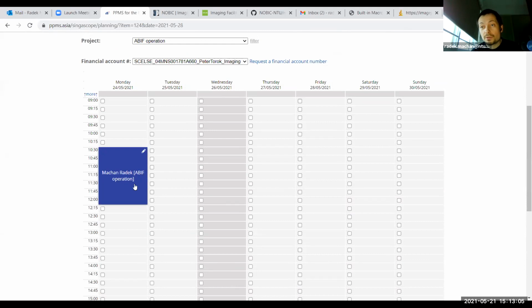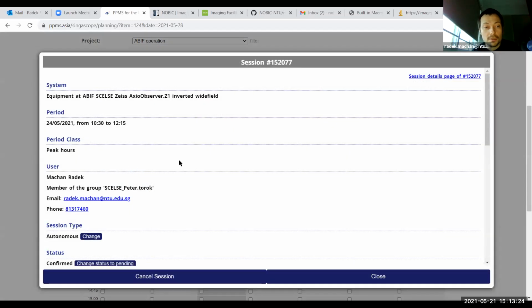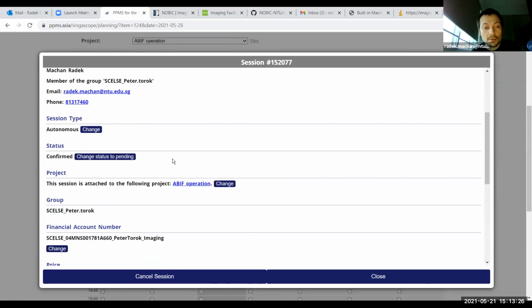There might be, of course, situations when you need to cancel your booking because, for example, you need to urgently do something else in the same time. You can cancel the booked slot. So if I click on it, then I can do some changes.